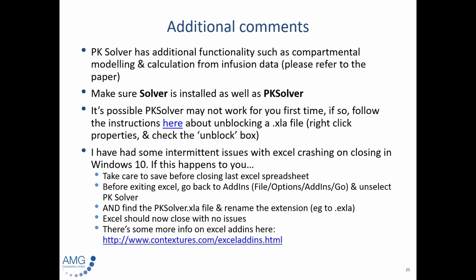Okay, a couple of other thoughts. As I mentioned, PK Solver does have additional functionality. I'm not a PK expert, more a user, so other people may want to dive into some of the other functionality. Certainly compartmental analysis and calculation from infusion data are some of the things that the tool will also do. In terms of installation, I gave the installation information earlier on. One thing that caught me out the first time was that you need to have Solver installed as well as PK Solver, and those two are different things, so you do have to install them both.